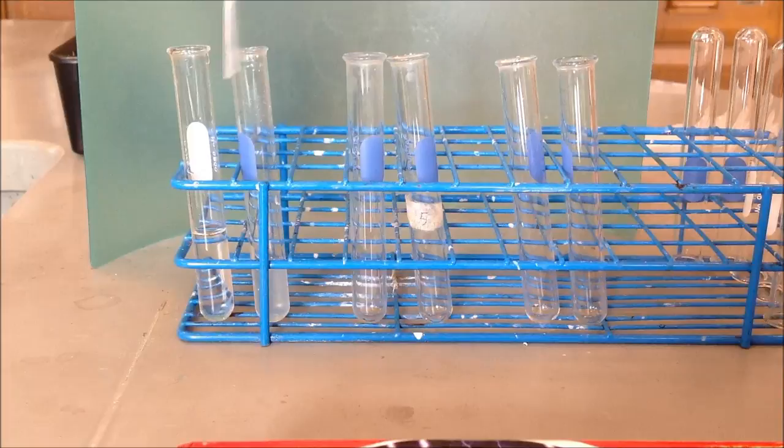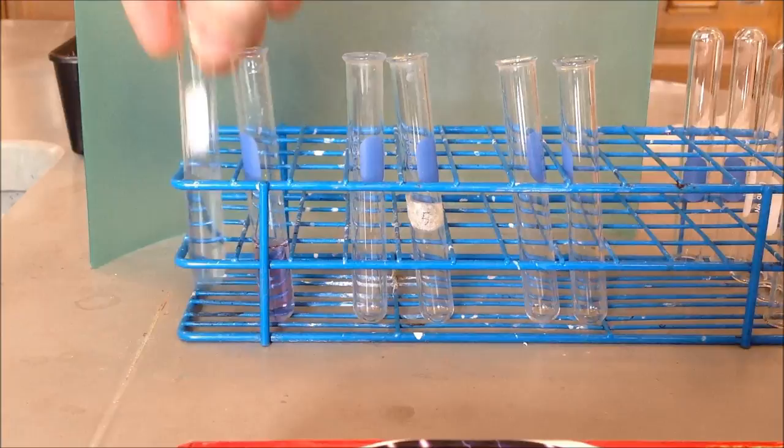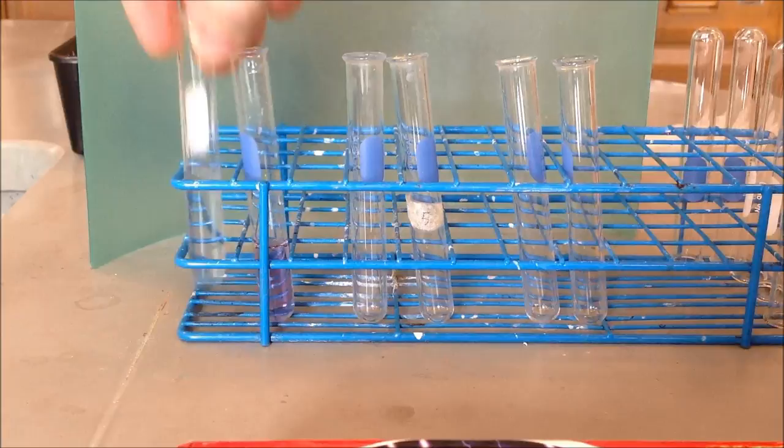We'll see what biuret looks like in a negative, or no-protein solution, and then also what it looks like in a protein solution. We have our negative protein and our positive protein. Biuret is what we use to test for the presence of those proteins.